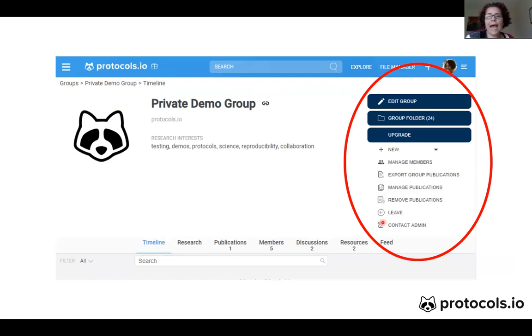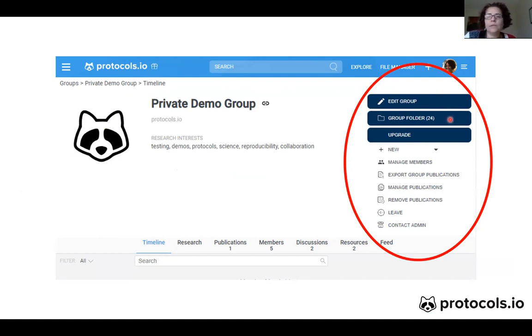This is the admin interface when I enter my private group. On this page, you can edit the group, you can check the group folder, but more importantly you can manage members.